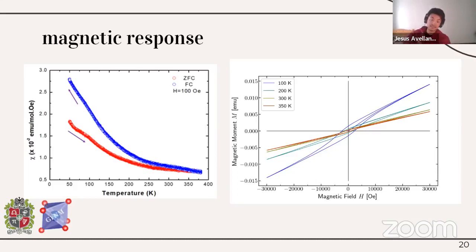But as you can see in this case, fortunately, we obtained this curve shown on the left, although this curve is not conclusive enough to exclude some possible paramagnetic behavior. It is a first indication that some interesting things might be happening inside of the material.